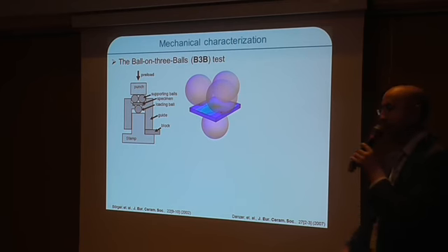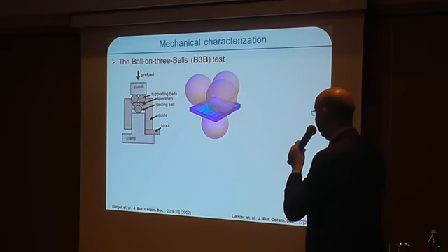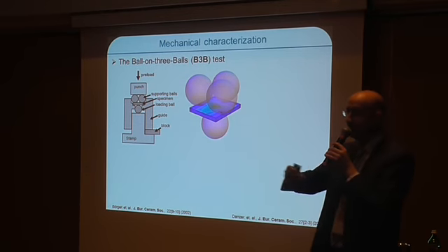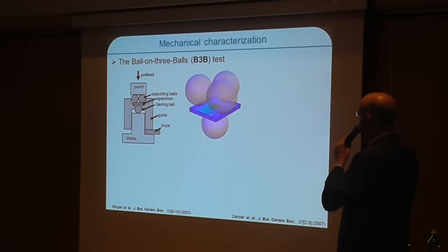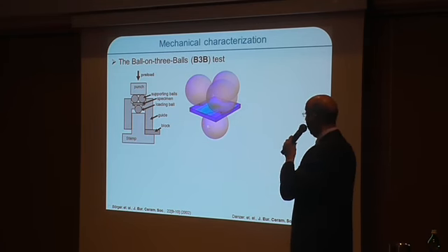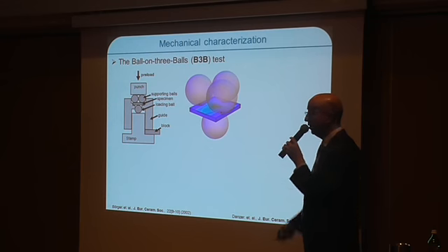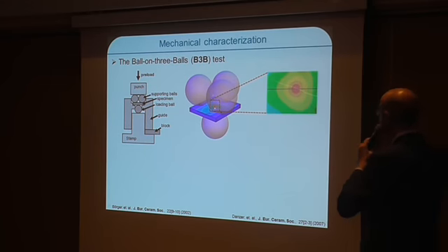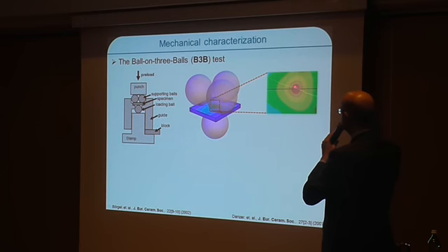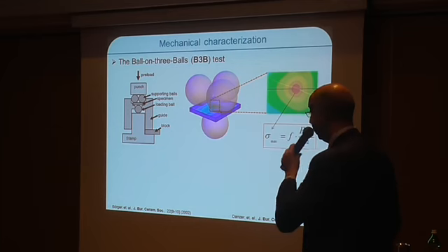In many cases, they have a plate-like or disc-like structure. So we cannot really go and make bars and do three-point bending or something. We have to adapt to the geometry. And for that, we developed what is called a biaxial bending test, where we put the plate-like components between four balls in a compression test configuration. In that case, if we press the four balls together, we will induce in a certain small region very high stresses, and eventually you will break your specimen or your component.